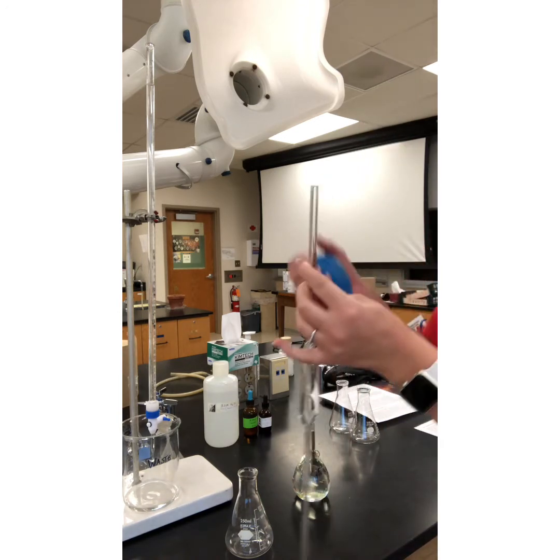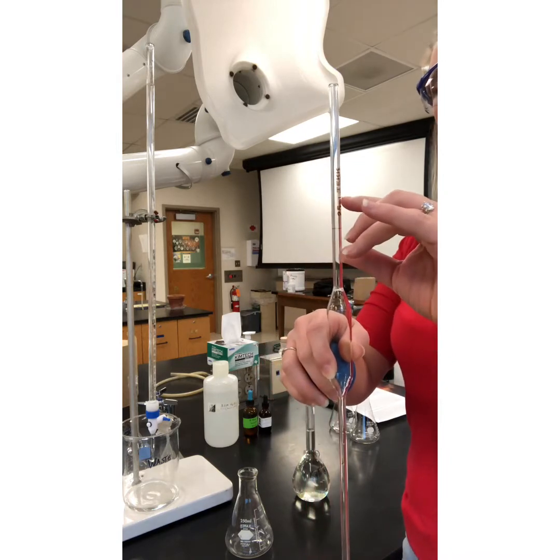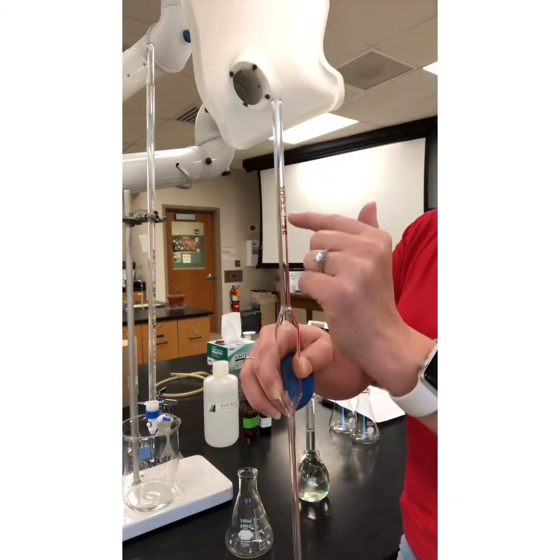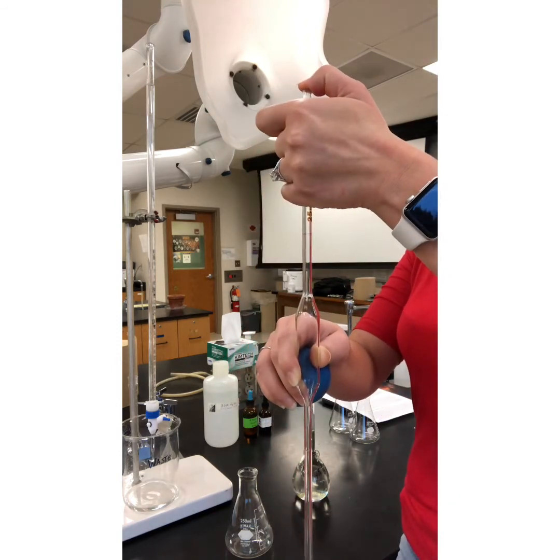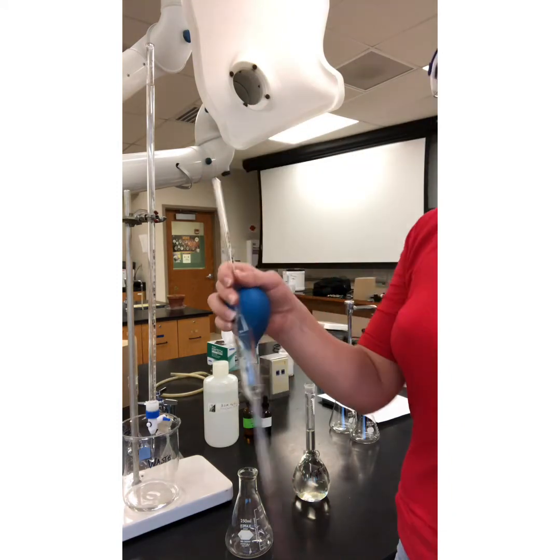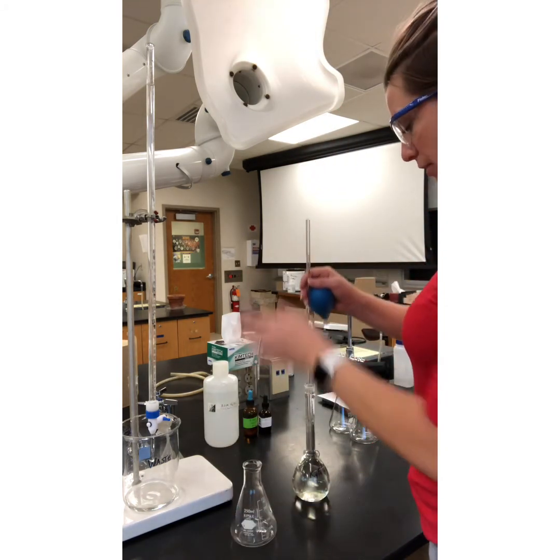Another thing to be careful of when you are sucking the solution up into your pipette, because you want to get it to this line, you're going to go just past that line, but be careful, because when your solution goes past this fat part of the bulb and gets to this skinny part here, all of a sudden it goes up really fast. So you have to be prepared to let it go. And then you put your finger on top and slowly release your finger until the solution comes back down, so your meniscus is right at the mark line, telling you have exactly 25.00 milliliters of your solution to deliver to your sample container.